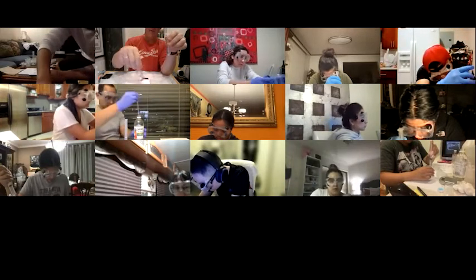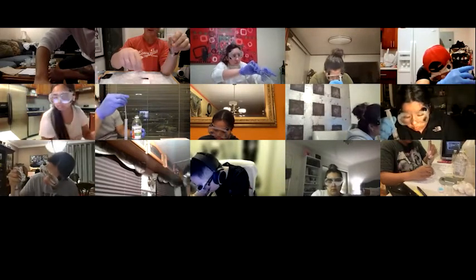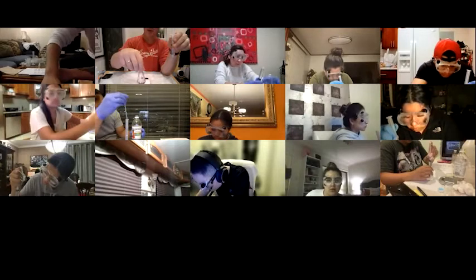And if any of you have figured out what the concentration of acetic acid is already, based on the 5%, you should pretty much know how much sodium hydroxide to add.